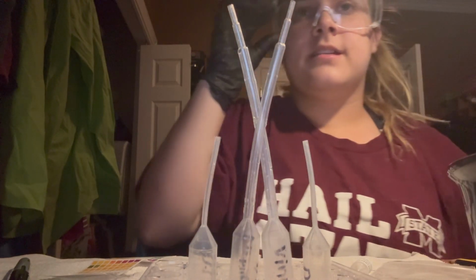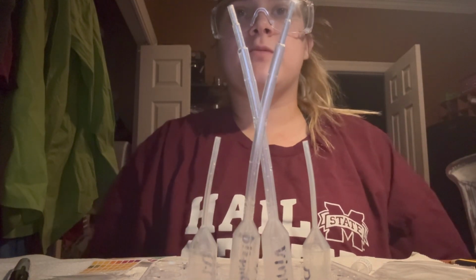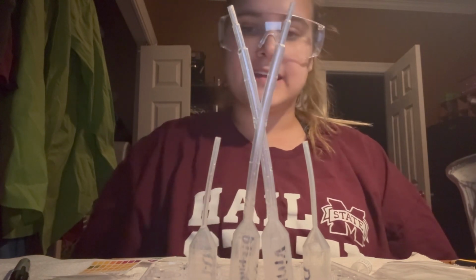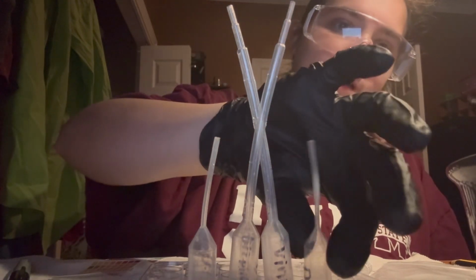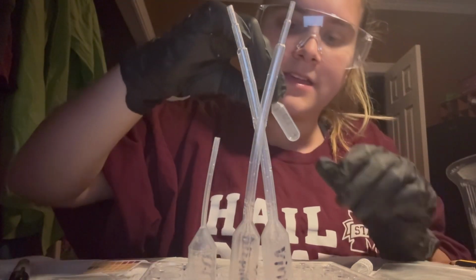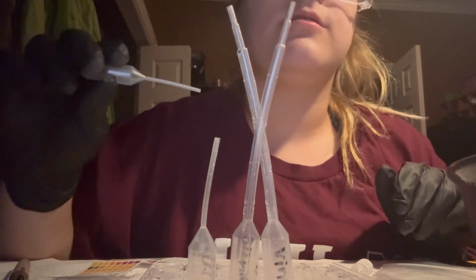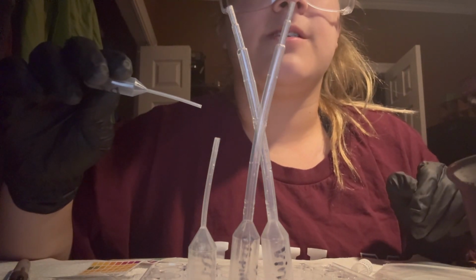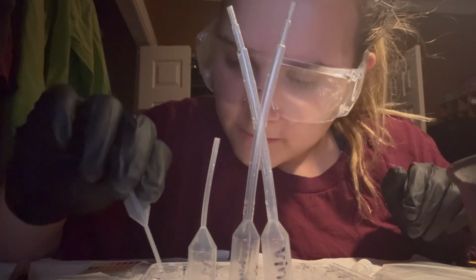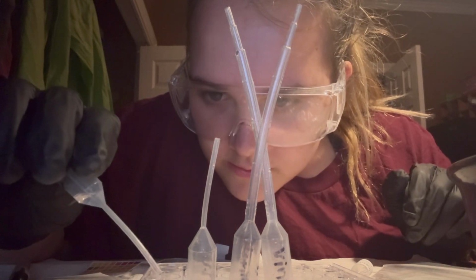For this part, it says to add 2 drops of 0.1 molar NaOH from well D6 using the D6 pipette, which is right here. So we will do, just like the last experiment, 2 drops. And we'll measure the pH after 2 drops.